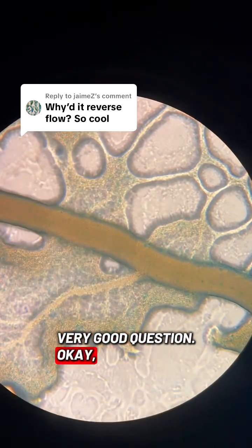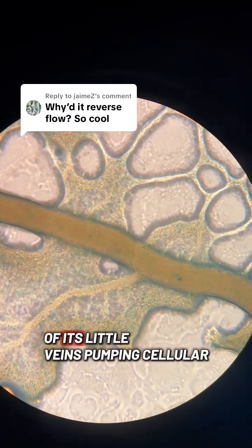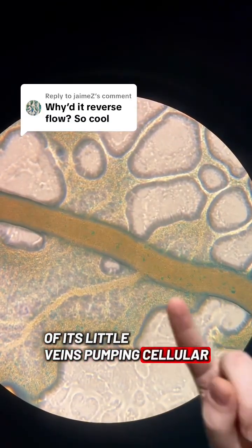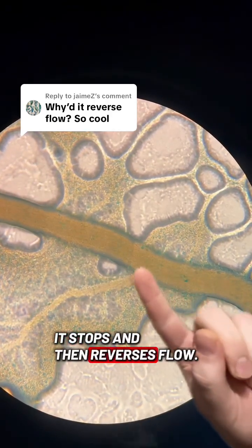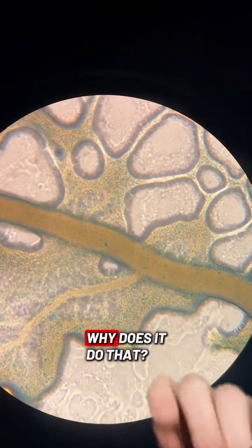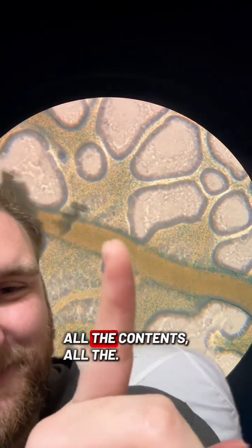Very good question. Okay, so watch this. We're seeing Physarum polycephalum, the slime mold. This is one of its little veins pumping cellular contents around, but look what just happened. It stops and then reverses flow. Why does it do that? That's so cool, man. You can see all the little contents.